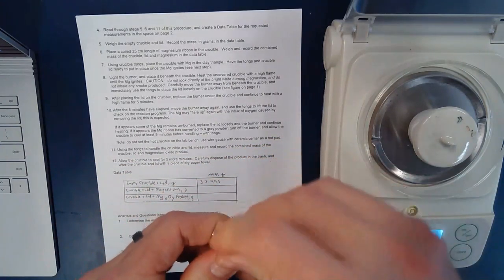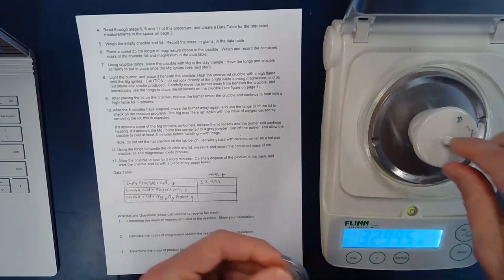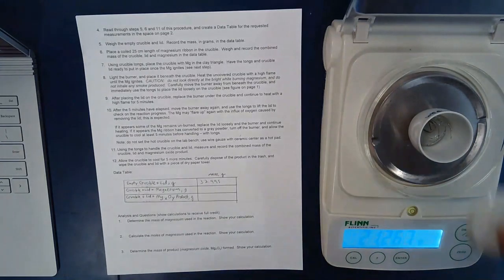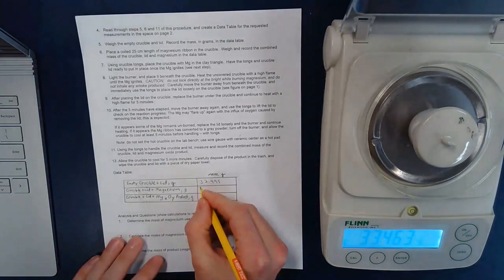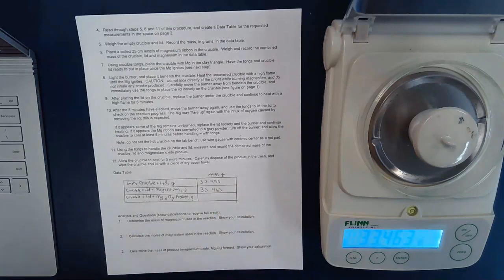Remember, we're reacting this with oxygen, so we don't want to cover up the magnesium too much. Okay, so I'm just going to put the magnesium in there, put that back on, and I get 33.463.